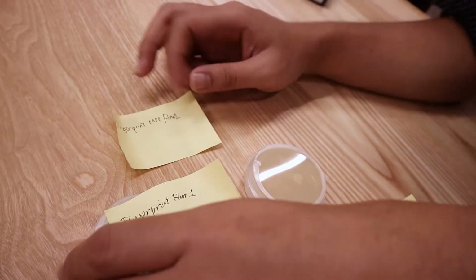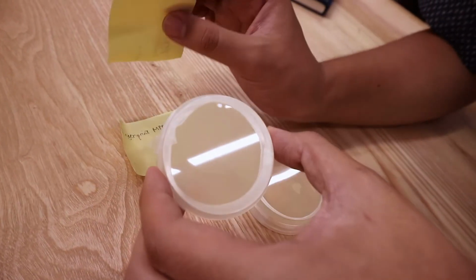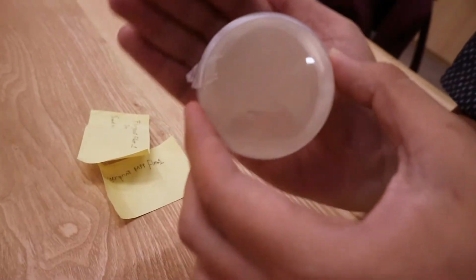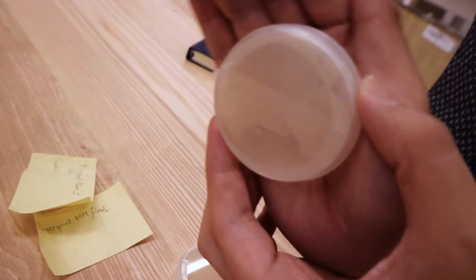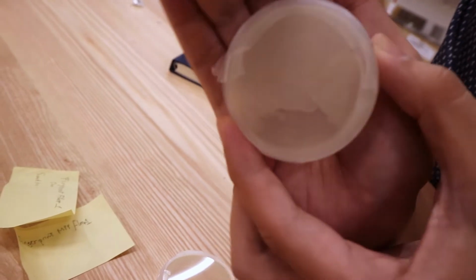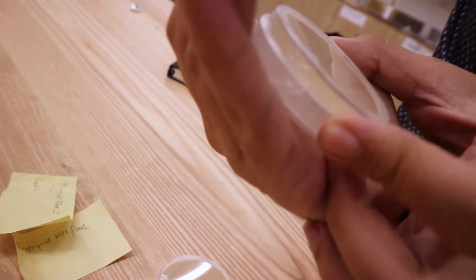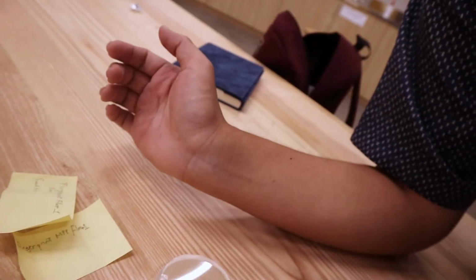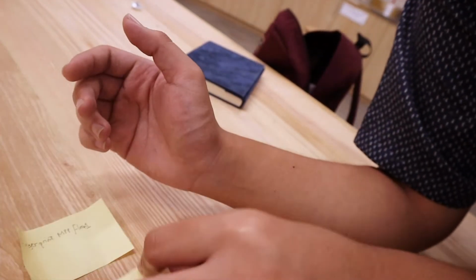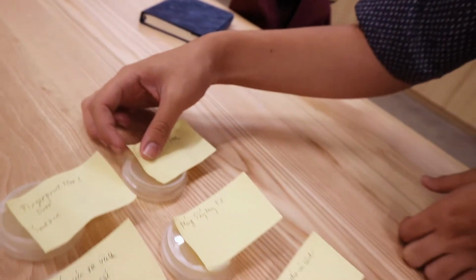Let's see the fingerprint on sandbox. Wow, stark contrast. You see the E. coli is covered like a whole plate on this side, which is egregious, which is astonishingly shocking. I don't want to use the fingerprint on this first floor anymore.